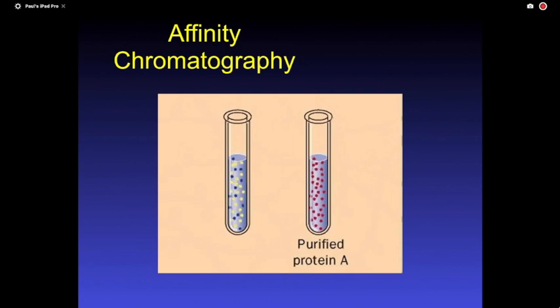And so when I put my elution buffer here that has that small molecule, I put the small molecule in the solution at such a high concentration that when this does open up, there are so many other molecules available that it may bind to the one that is free, not the one that is linked. So it's bound to the one that's free, but it's free falling. And it falls out the column.